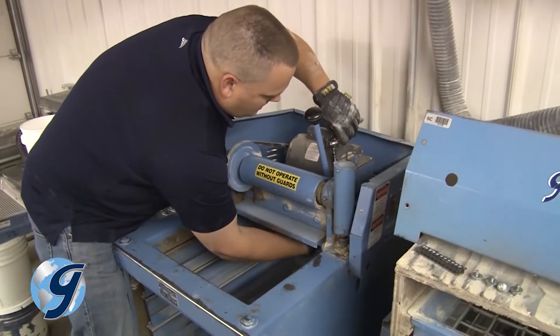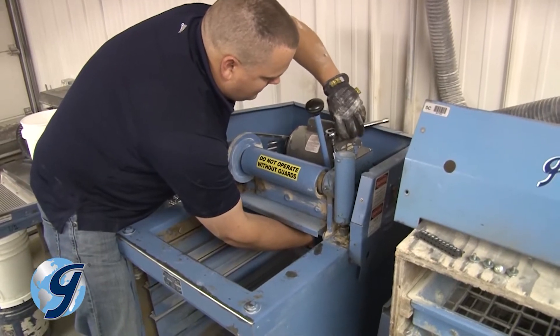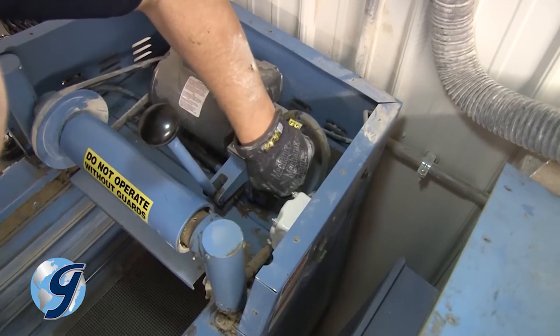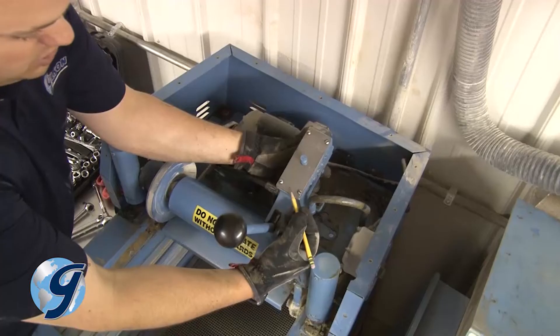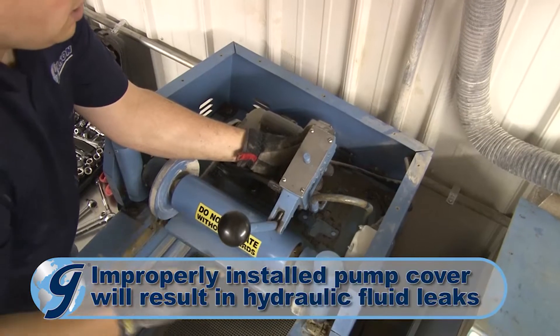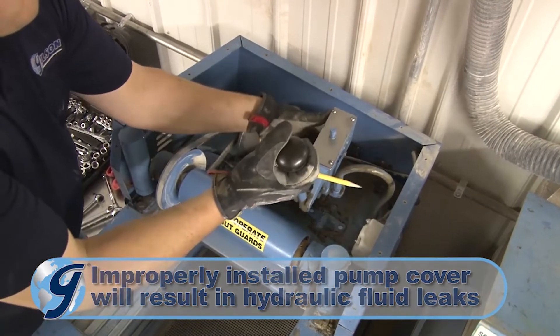Next, unfasten the three bolts that hold the pump in place. To gain access to the rightmost bolt, rotate the 90-degree hydraulic fitting up. Mark the pump cover and pump so when it's reinstalled later, the pump cover will face in the correct position.